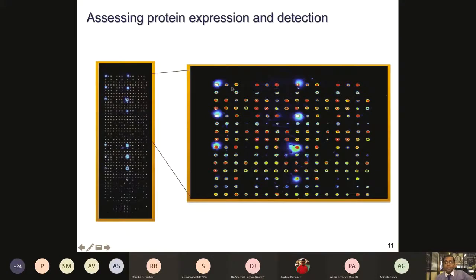These are some of the real experimental slides which I'm showing you here. In this case, you're looking at some breast cancer patients, and one of the highly expressing proteins, the EBNA protein for the breast cancer, was very highly expressing, and all the neighboring spots are getting affected because of the huge expression of this protein. So that is something you have to keep in mind. Maybe in the next set of experiments, you have to keep this protein separately and avoid having so many closely neighboring spots.